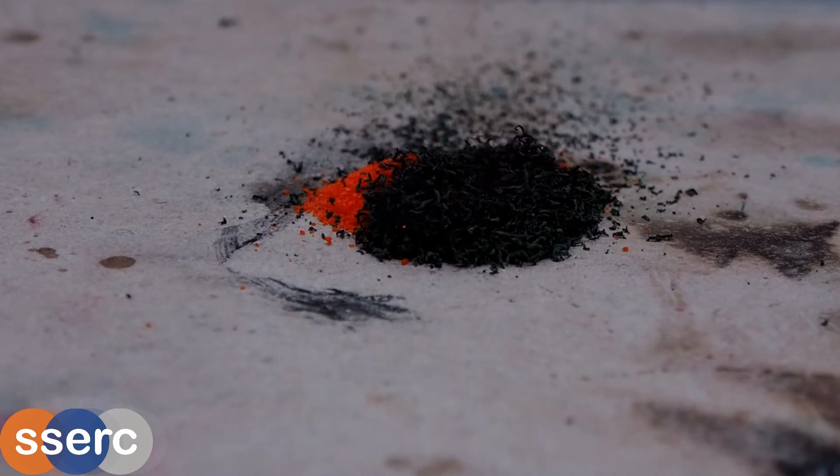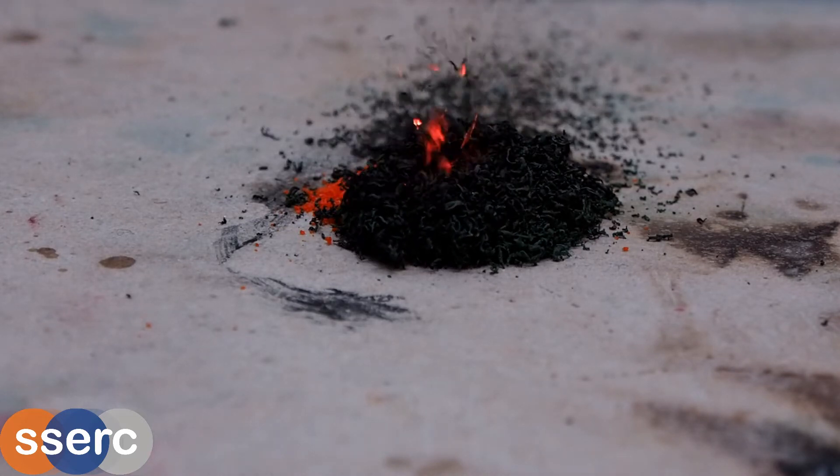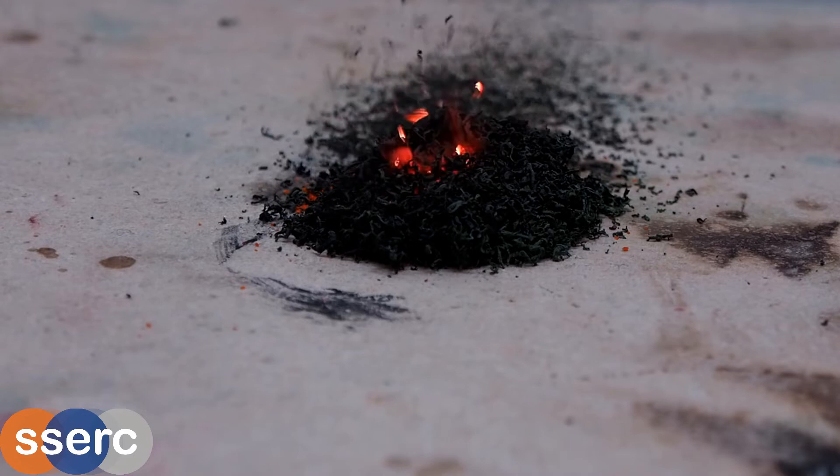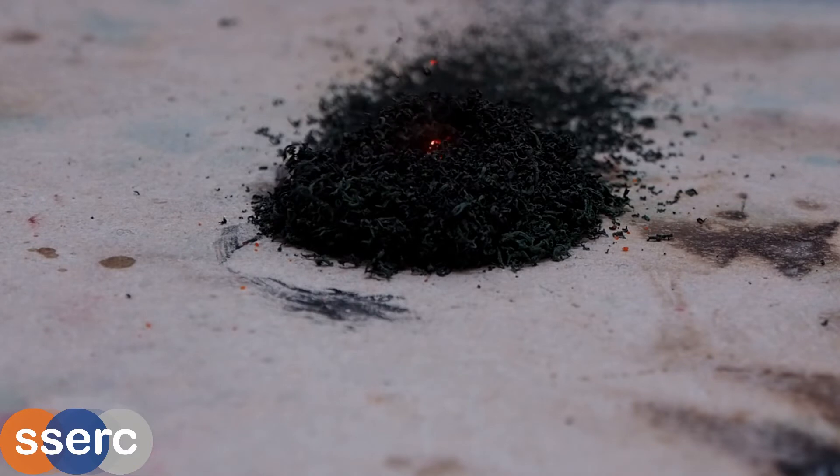You put a small pile of ammonium dichromate onto a heatproof mat in a fume cupboard and set light to it. Once lit it behaves like a miniature volcano producing orange sparks and a pile of dark green solid, chromium oxide.